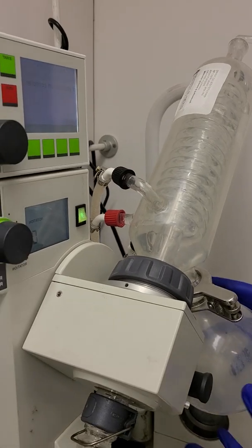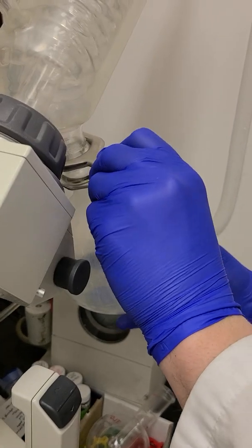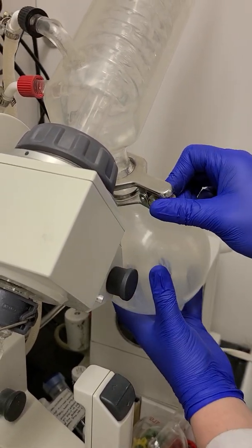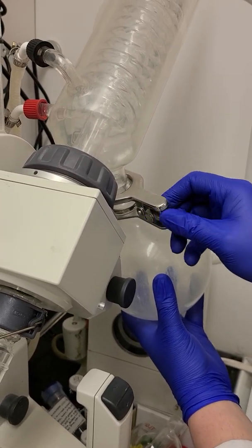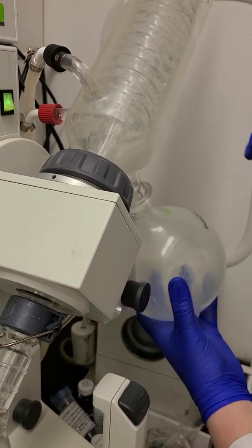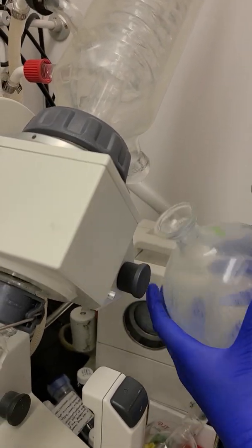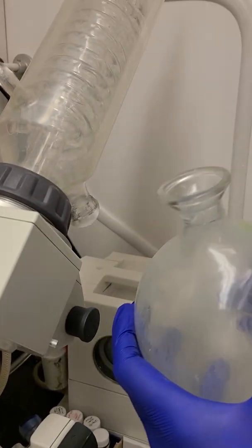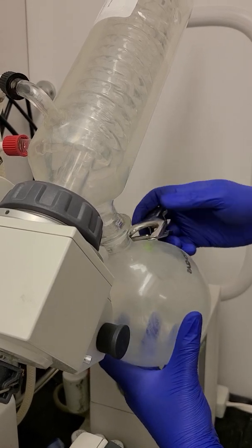You want to collect the solvent, which then drips down into this large collection flask. The collection flask is secured by this clamp. This clamp screws, so you unscrew the clamp, lefty-loosey, righty-tighty, like this. And you remove this like this. It is also greased for a tight seal. This can be emptied at the end of your experiment. Make sure that it's secure so it doesn't fall off.